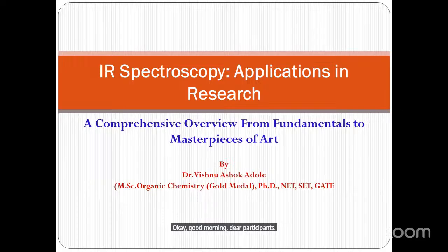So today I will be discussing with you an important spectroscopic method as far as research is concerned, and that is IR spectroscopy. Today's session is basically divided into two parts.